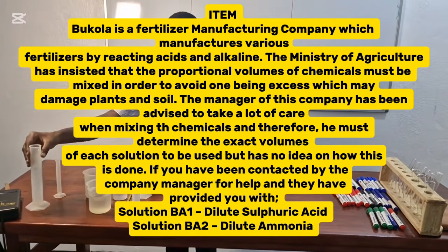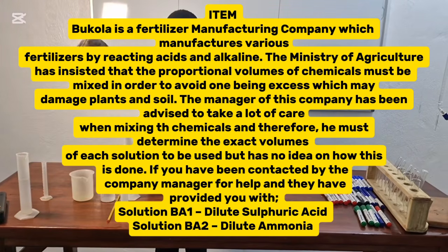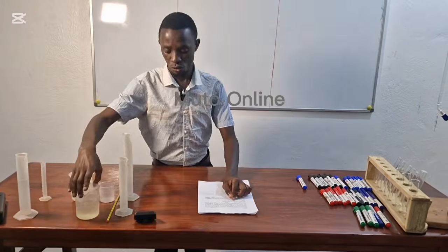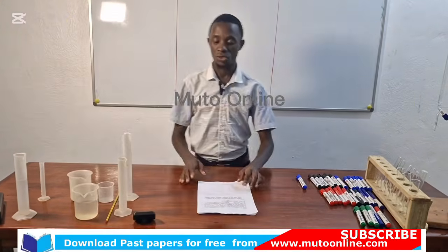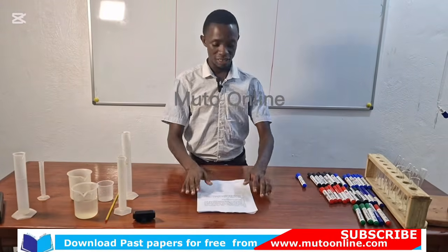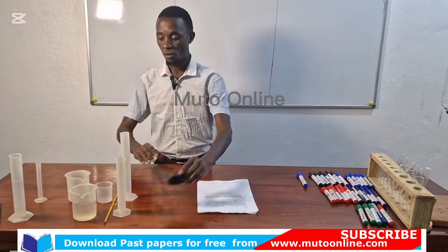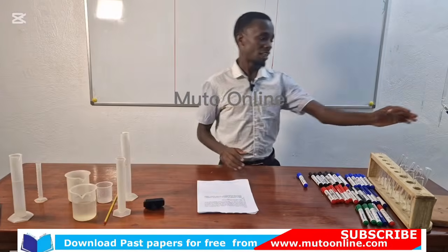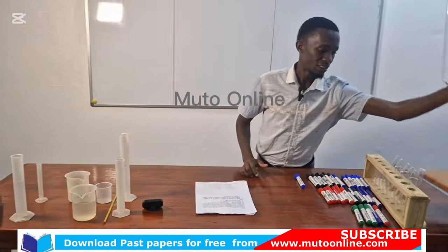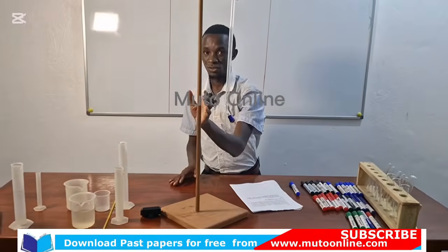This is our solution BA1, and this is our solution BA2. So we have the two solutions, BA1 and BA2. The set of the item told us that in the confidential we provide you with all these things you see here, plus these ones here, that on your table we include all these ones you see.